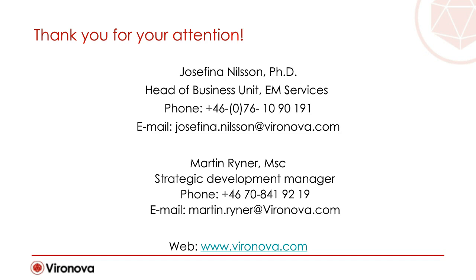Okay, thank you. The next question we've got is, how much maintenance is needed for the instrument? Yeah, so we have a service, normal service time is every 6 months. Okay, great. Thank you. The next question we've got is, what sample size is needed? If we are talking about volume here, we normally apply 3 microliters to the grid per sample.